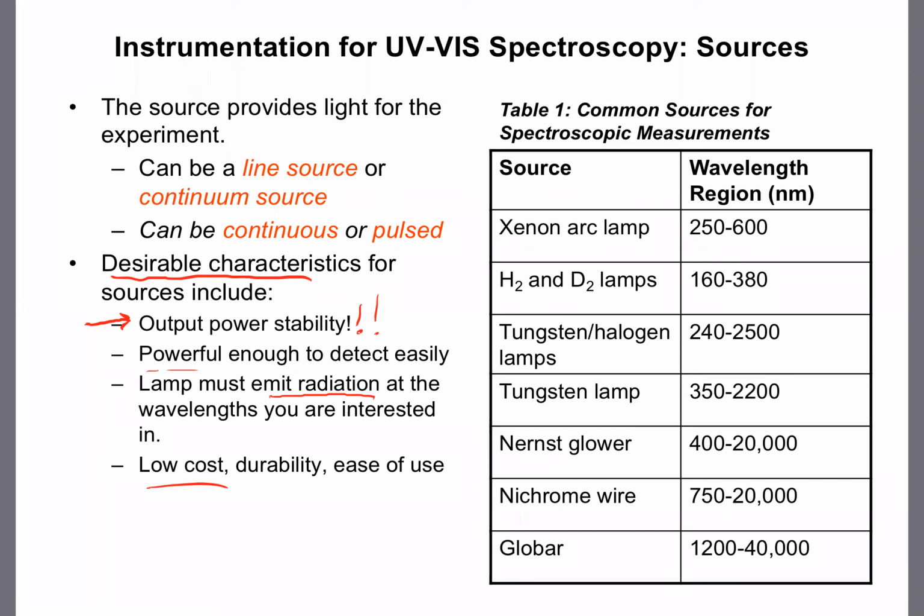Also important, there are certain spectroscopic sources which meet all of these characteristics, or most of the characteristics, but there's not really a perfect source, okay? They are listed over here in this table.